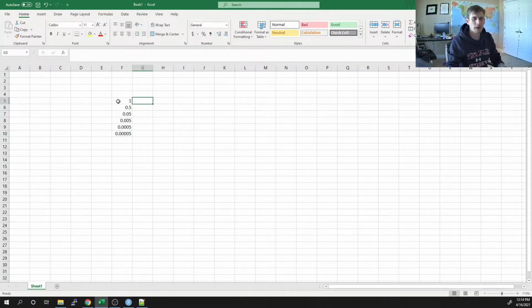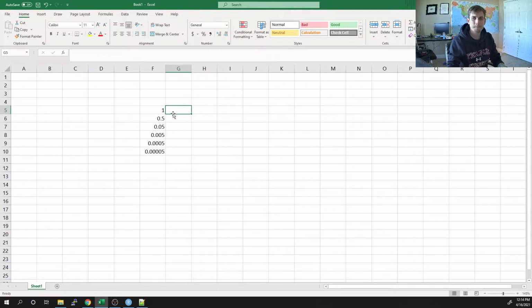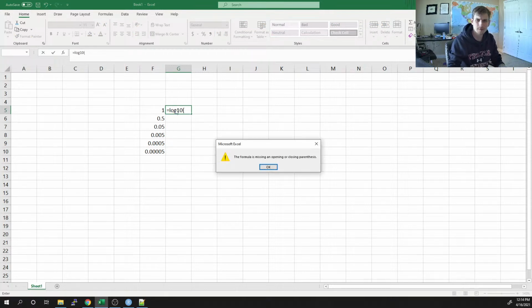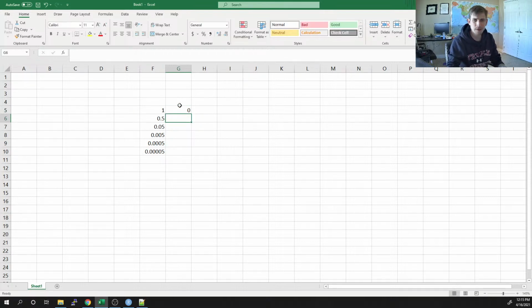All right, so we have these pseudo-esque p-values, in which case I take the log 10 of this. Right, it's going to be 0, whatever. But I'm going to take the log 10 of all these others.